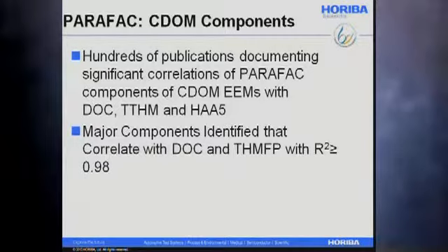And it just so happens that parafac has recently been exploding in terms of the number of publications. There are dozens, if not hundreds, of papers now that show that the major components that you can identify with the parafac correlate very highly with the dissolved organic carbon and trihalomethane forming potential.